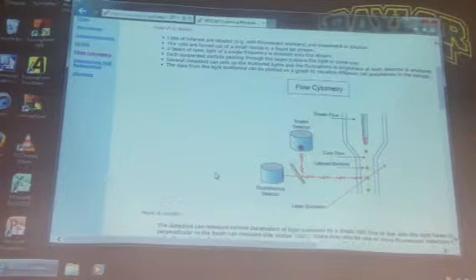And if you say, well, only 1 in 1,000 of my cells are fluorescing, you say, well, there aren't many Salmonella in Lake Waco water. But if it's 1 in every 4, then there are a lot of Salmonella in the Lake Waco water.